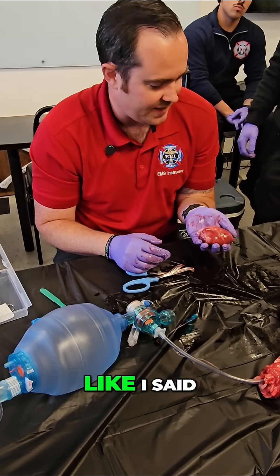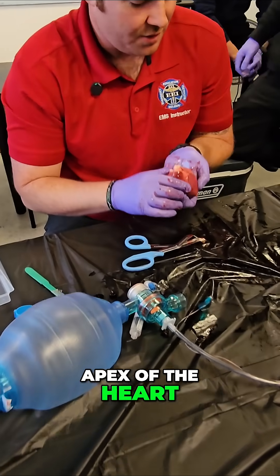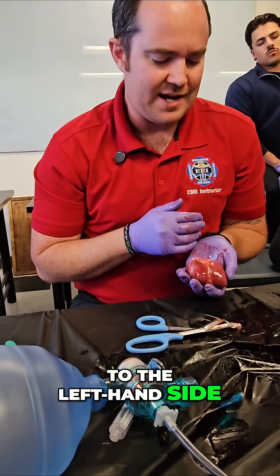This heart, obviously, like I said, belongs to a pig. We can see that the apex of the heart goes there a little bit to the left-hand side. So when it sits in the middle of your chest, it's pointing to the left-hand side.